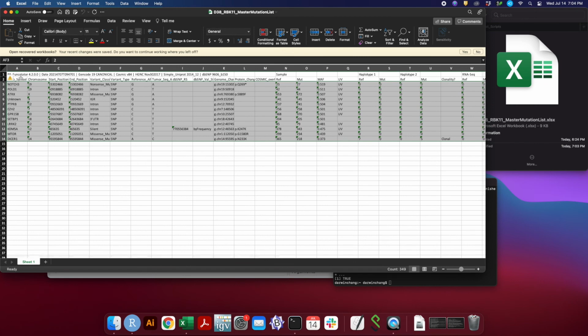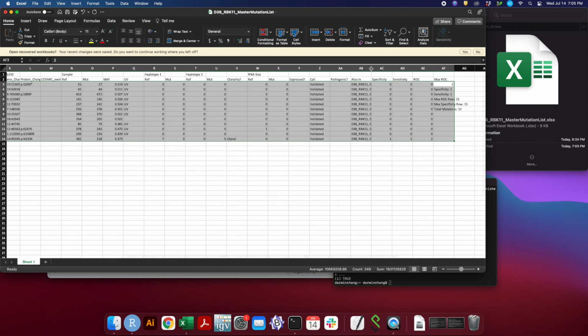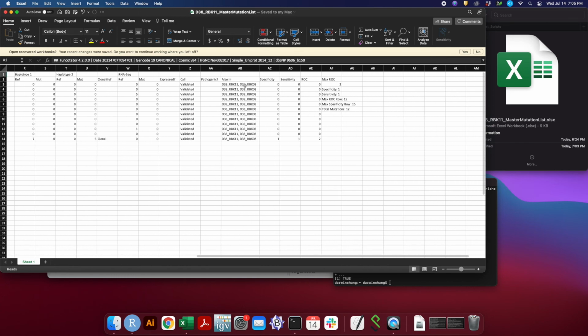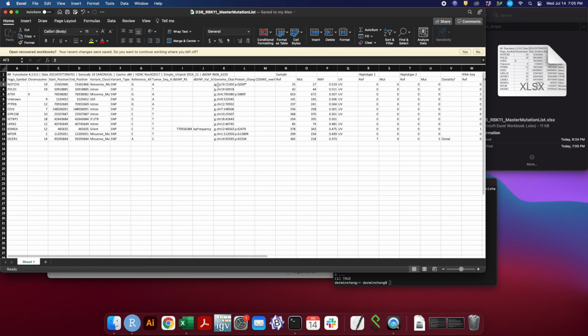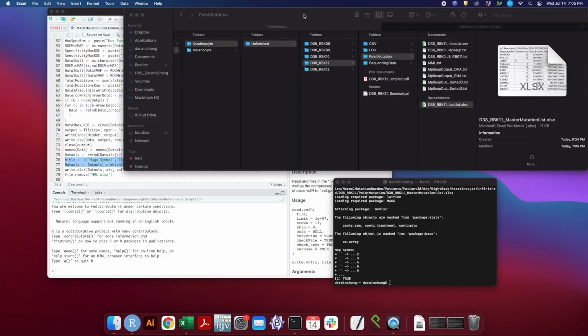But in this particular sample, these are actually two keratinocytes that are related. And keratinocytes, at least currently in our single cell clonal expansions, tend to grow out pretty quickly, so it's pretty likely that these are cultural artifacts. However, we just need to finalize all this. It looks all good, and that is it.